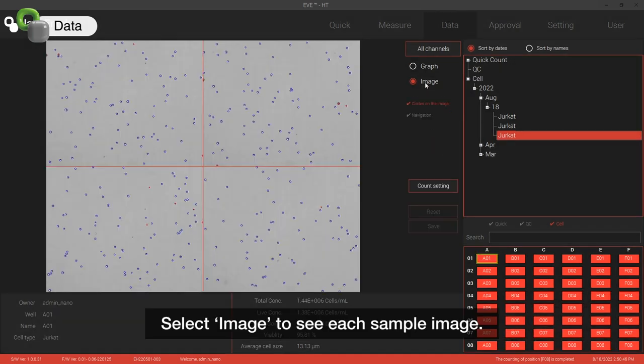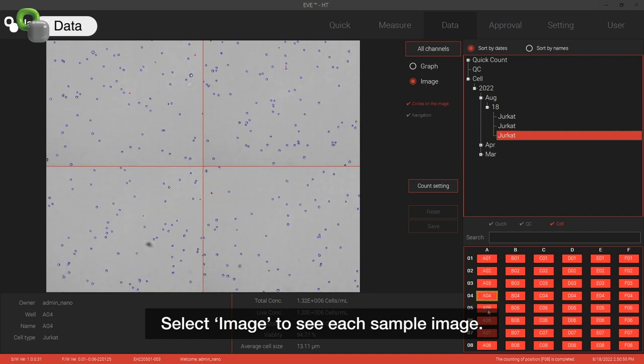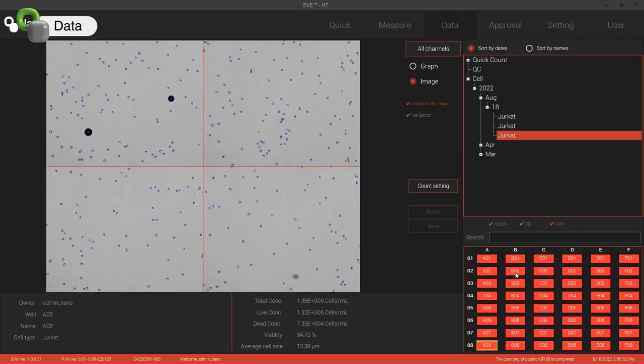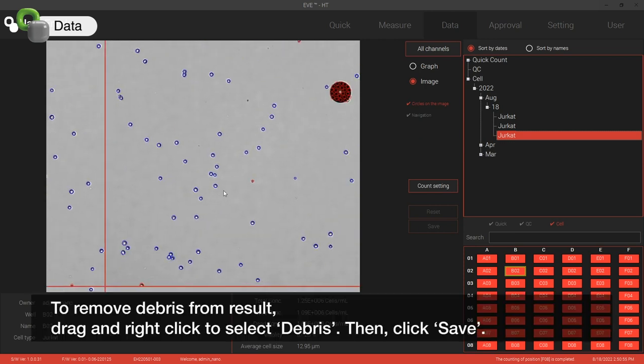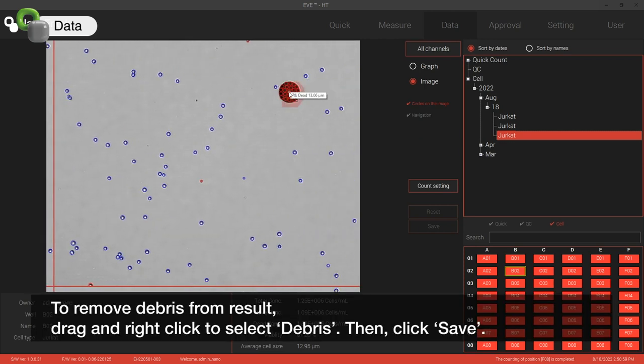Select Image to see each sample image. To remove debris from result, drag and right click to select debris. Then click Save.